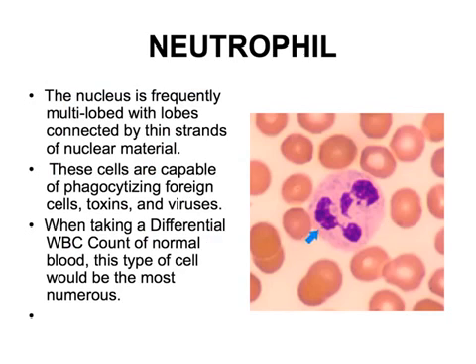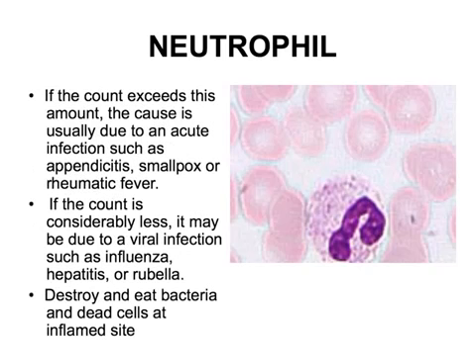So here we have our first leukocyte, or white blood cell, that we're going to identify. As we notice right here, this darker stained area is the nucleus of the cell. As we look at it, we'll notice that it's multi-lobed, or spread out like a bead of pearls. And that's indicative of neutrophils. Here we have another neutrophil. This one is a little clearer as far as looking like a strung out series of pearls.